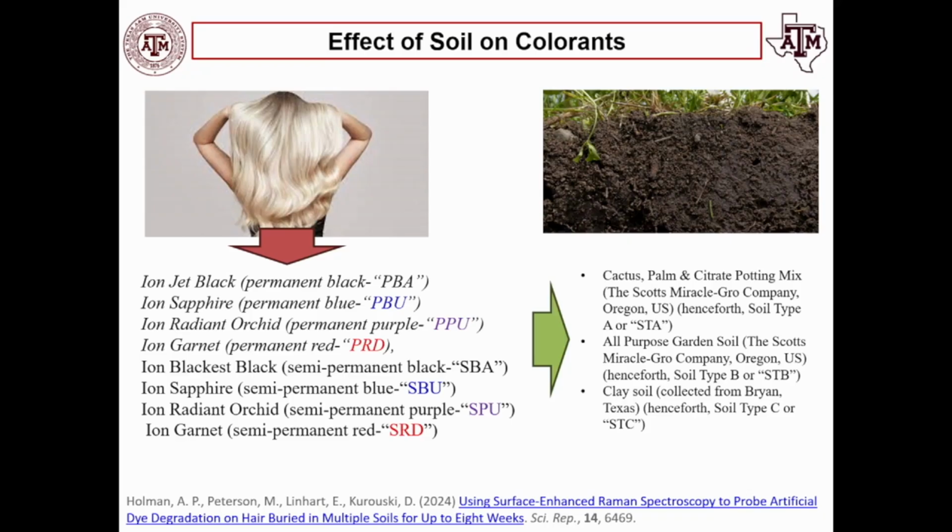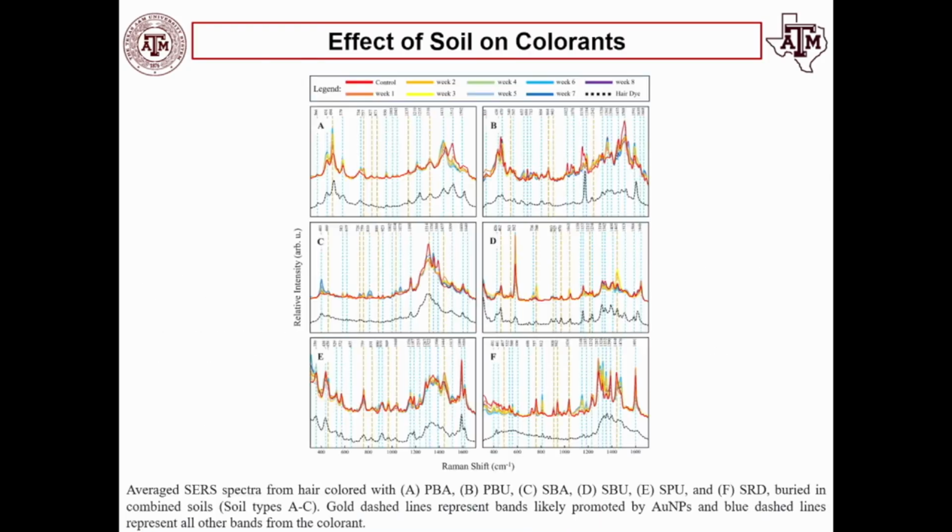Well, very recently, we challenged ourselves to answer the question: to what extent can soil alter the SERS-based analysis of colorants? To do this experiment, we dyed blonde hair with permanent and semi-permanent colorants, and we exposed them to three different kinds of soil. And what we found is very interesting results.